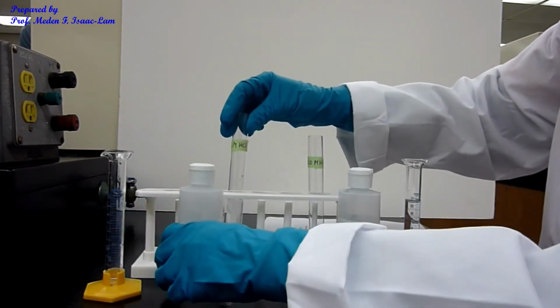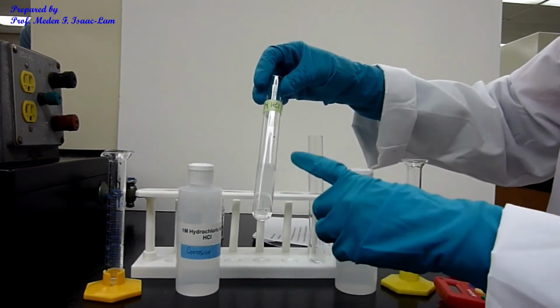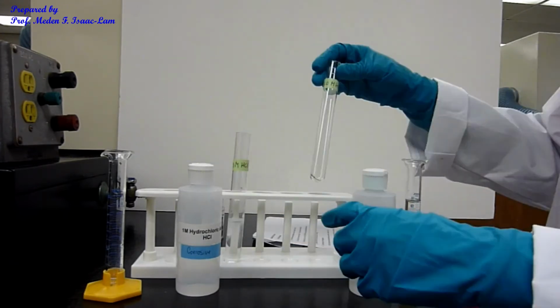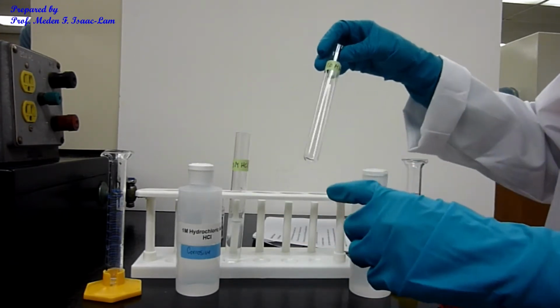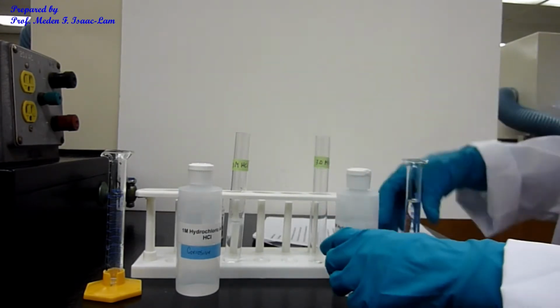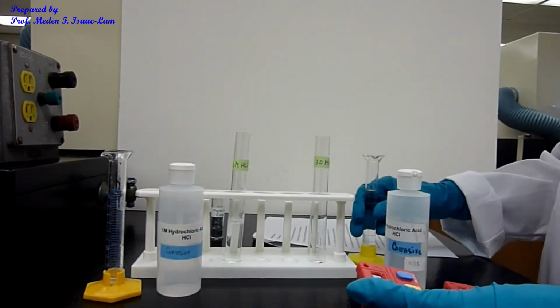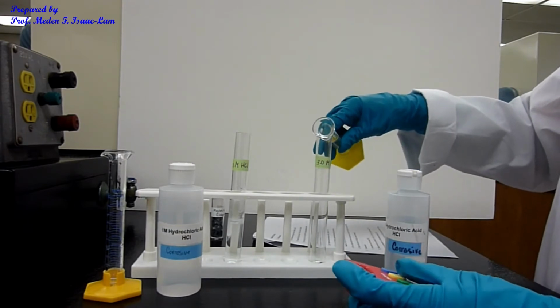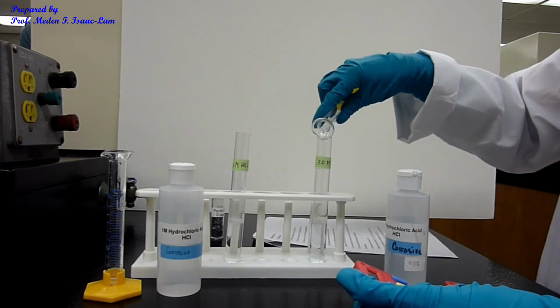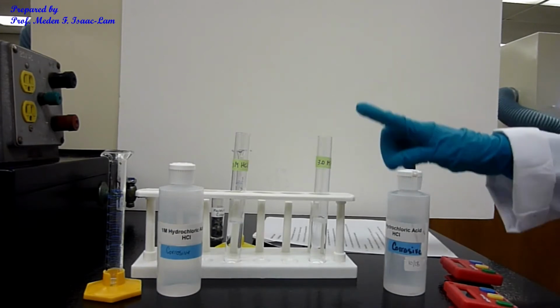So you're seeing some bubbles in here. Again, lower concentration, 1 molar. And then I'm going to do the same thing for the 3 molar. I already measured 3 molar hydrochloric acid in the cylinder. And then we're going to set the timer once I start pouring. You can hear that fizzing sound, and you can also see the gas coming out.